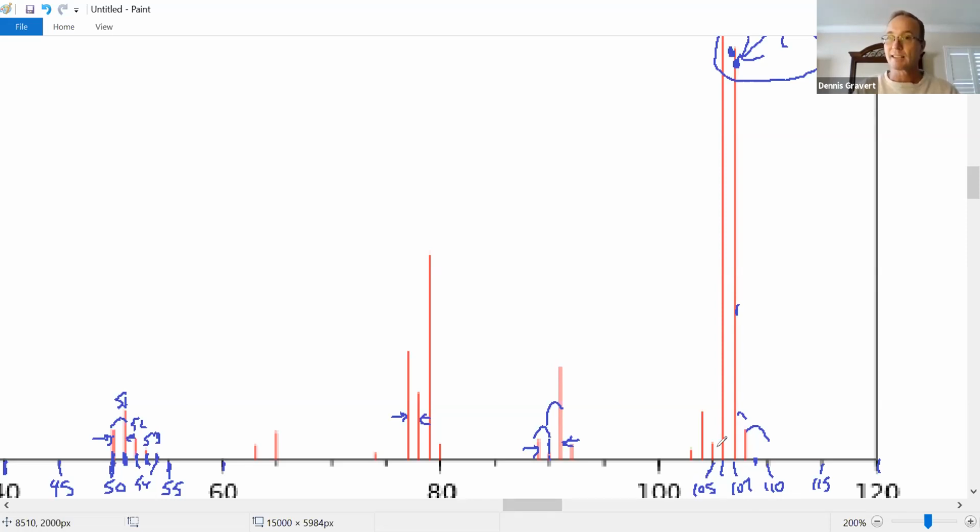Yay. And so I like seeing this on your work and give you partial credit. If I see that you said it was actually 109, I would have said, oops. Yeah, this is the 110 mark, but this is not 109. Yikes. Anyways, hope I made that clear. So over here, one mass unit is this far apart. Count them up. Yeah, 107. That's the mass value for our parent peak. What do you do with that? You divide it by 12.